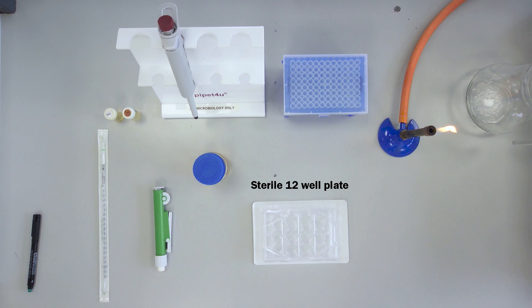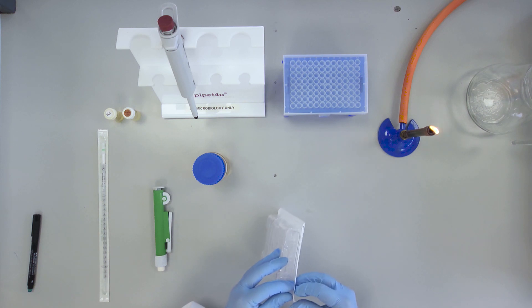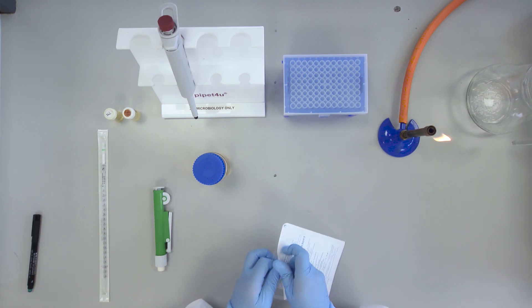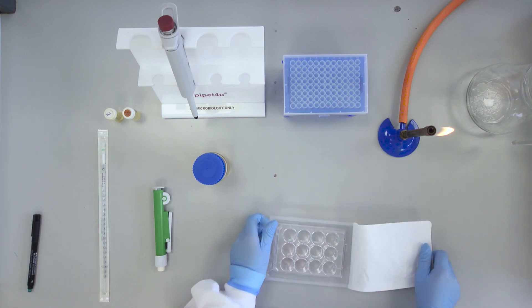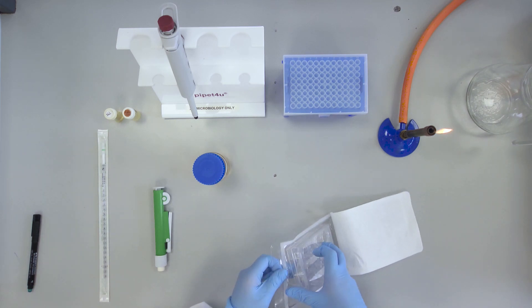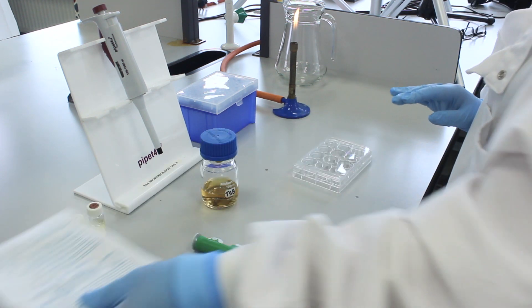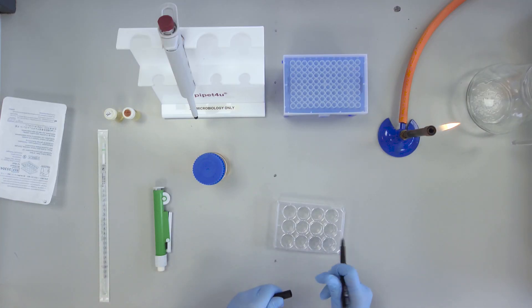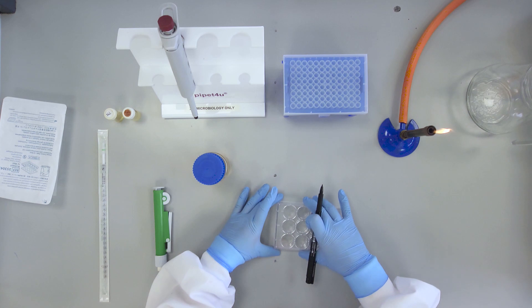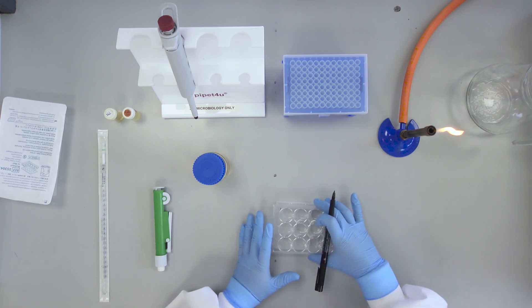First, remove the sterile 12-well plate from its wrapper. In order to allow correct orientation for interpretation of results after incubation, partially remove the lid to allow you to mark the top left-hand corner of the plate number 1, and the bottom right-hand corner number 12.